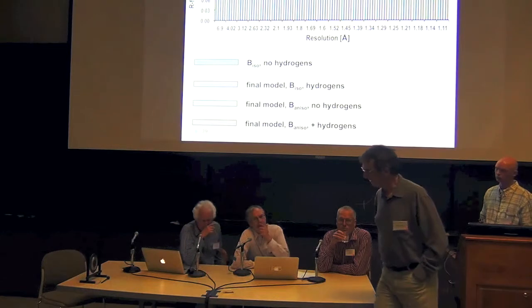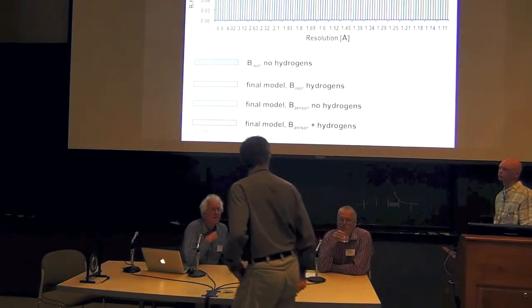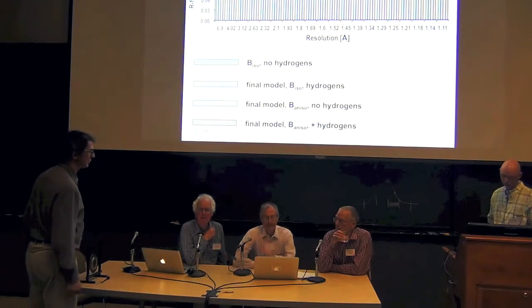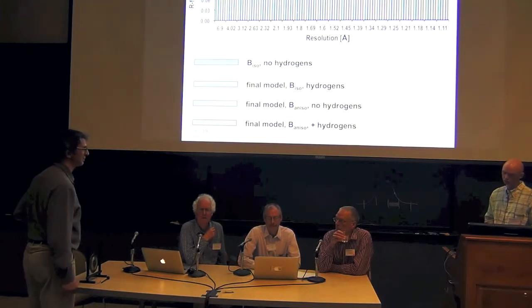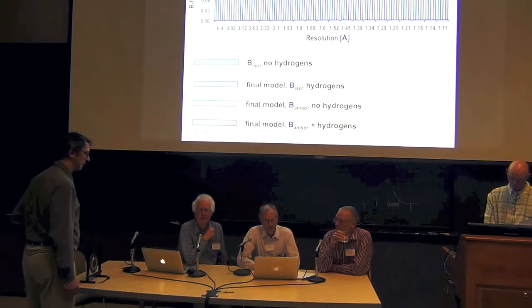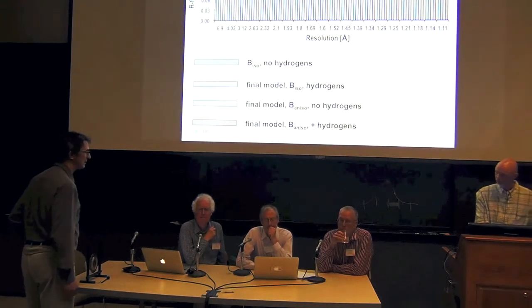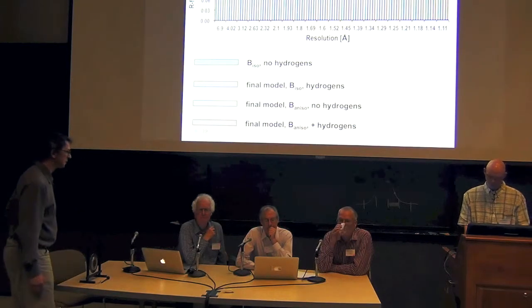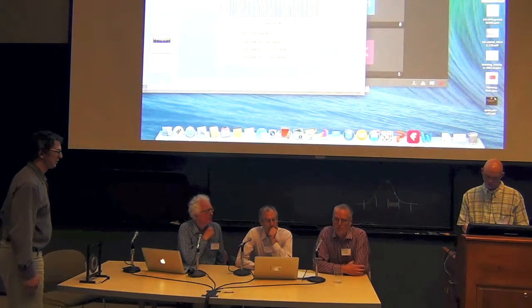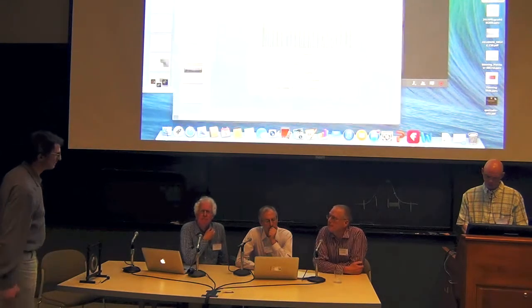CC1/2 was about 99%, 90% at least. It's because at the lower R-free, the data which are noisy are not very informative because the model is more accurate. So essentially you don't have much new information. CC1/2 is useful if your models are not very accurate. This was probably better than a typical model.